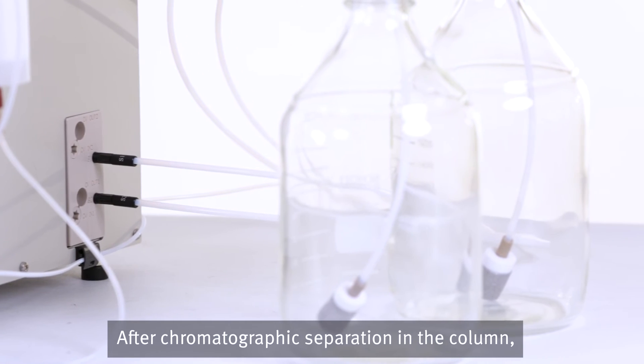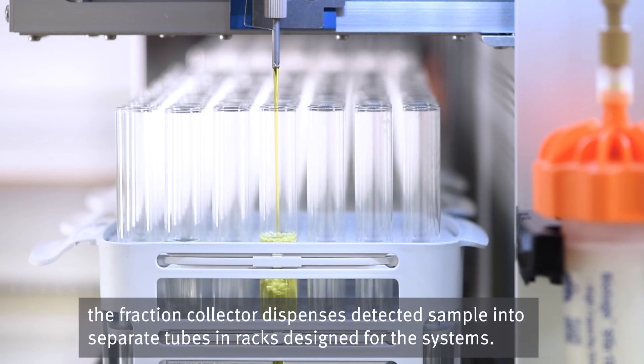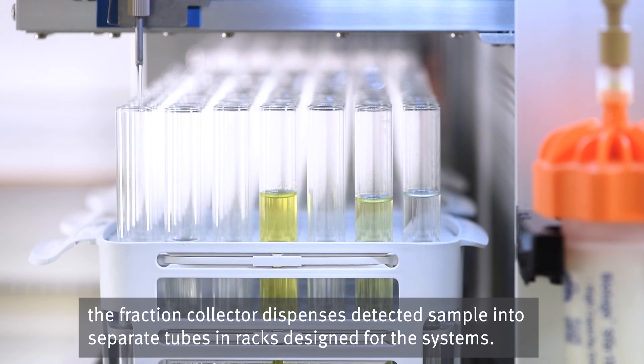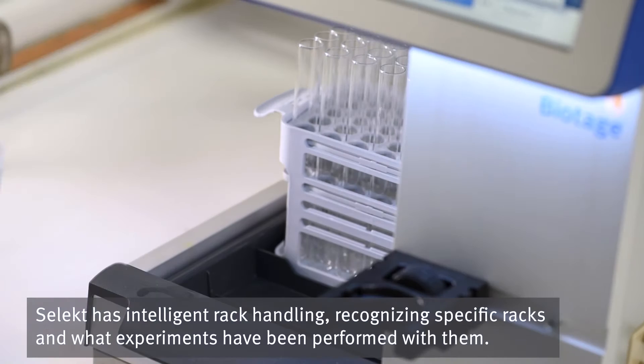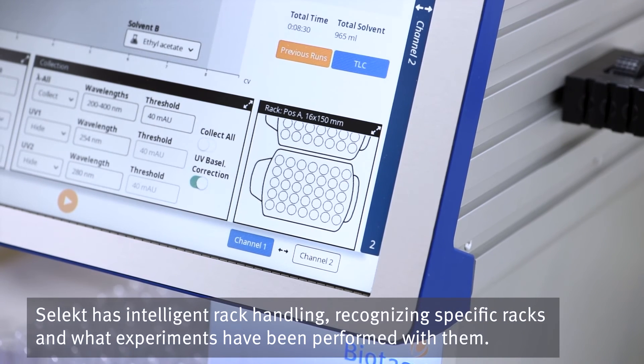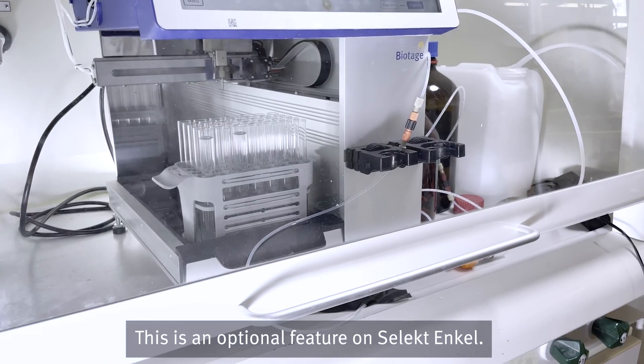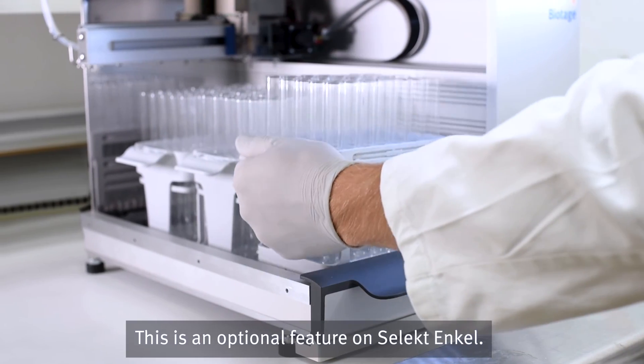After chromatographic separation in the column, the fraction collector dispenses detected sample into separate tubes in racks designed for the systems. Selekt has intelligent rack handling, recognizing specific racks and what experiments have been performed with them. This is an optional feature on Selekt Enkel.